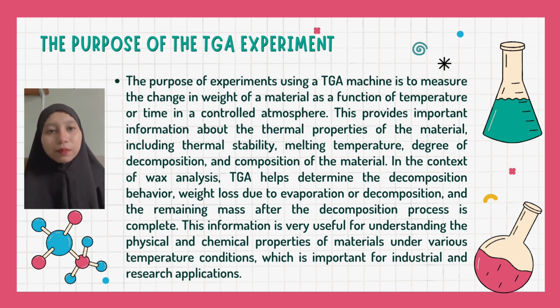This provides important information about the thermal properties of the material, including thermal stability, melting temperature, degree of decomposition, and composition of the material. In the context of wax analysis, TGA helps determine the decomposition behavior, weight loss due to evaporation or decomposition, and the remaining mass after the decomposition process is complete. This information is very useful for understanding the physical and chemical properties of material under various temperature conditions, which is important for industrial and research applications.